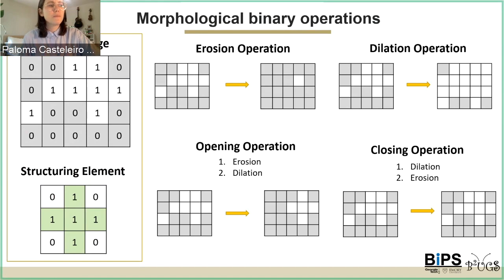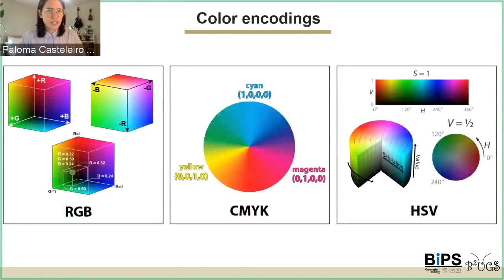So now that we've talked about grayscale thresholding, we need to discuss the fact that color plays a huge role in segmentation for a lot of microscopy images. For example, if you're doing bright field, like that other image that I showed you, you have color images. You can use the color of the images for segmentation. If you're doing fluorescence, you also rely on color quite a bit. So let's look at the other image that I had before with cells. You can break it into different kinds of maps, right?